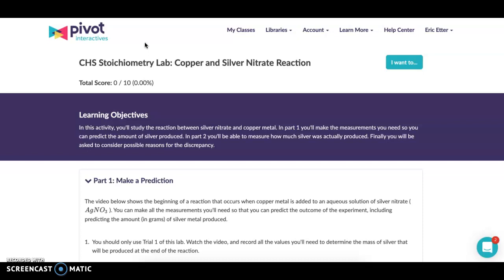In this lab, you will be watching a reaction between copper and silver nitrate, and you will be doing stoichiometry and comparing the results that maybe you should get to the results you should have gotten. We will look at that a little more next week.